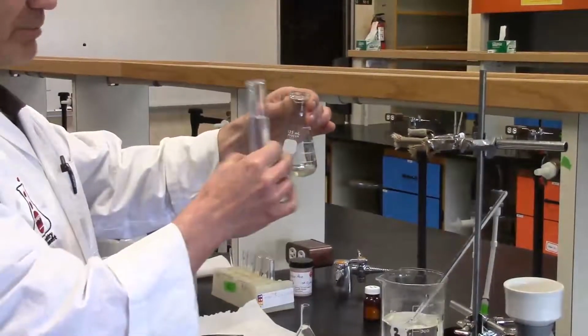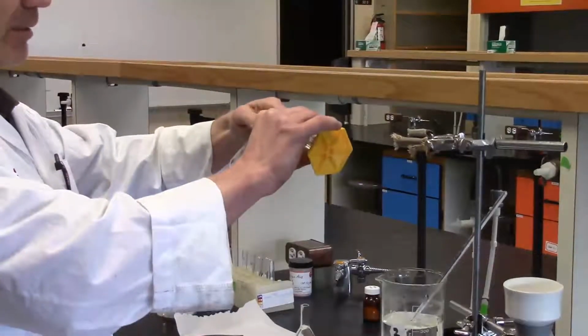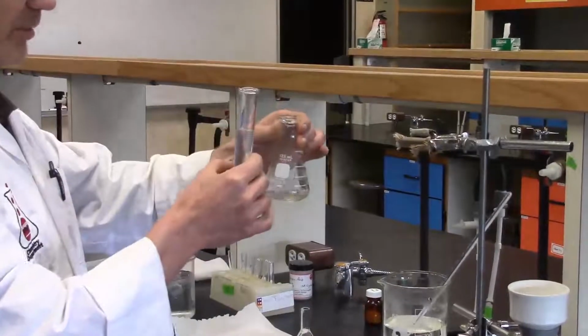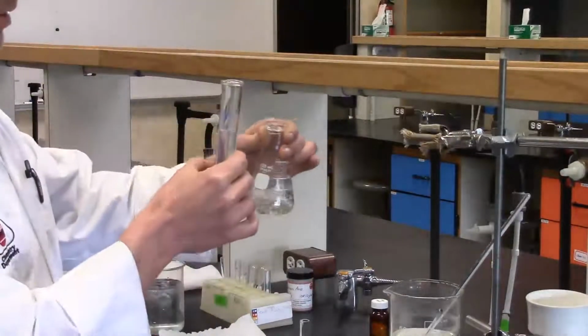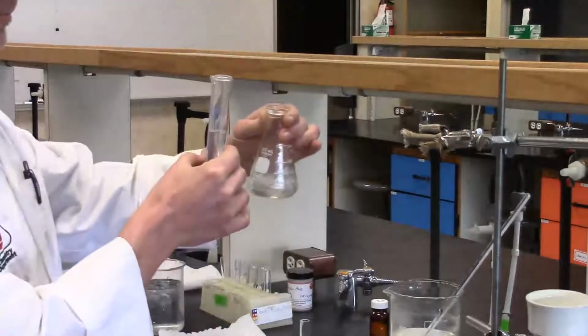When you first add, be careful. You will see a little bit of boiling there, so watch it. Don't be sticking your head right at the corner of the Erlenmeyer. Swirl with each addition, and be fairly quick on this. So I'm adding 2 to 3 mils at a time of ice cold water.